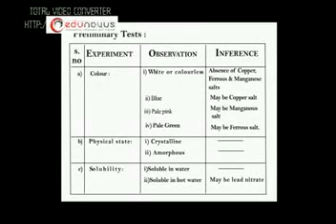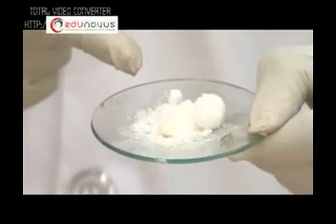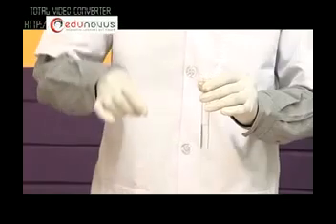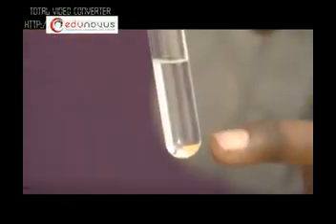Now, the next test is physical state. The physical state of the given sample is crystalline. Now, the next test in the preliminary examination is solubility. We observe that the given salt is insoluble in cold water.